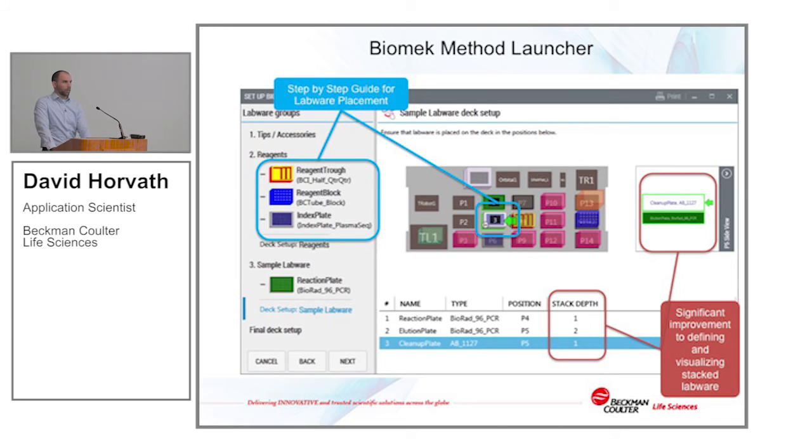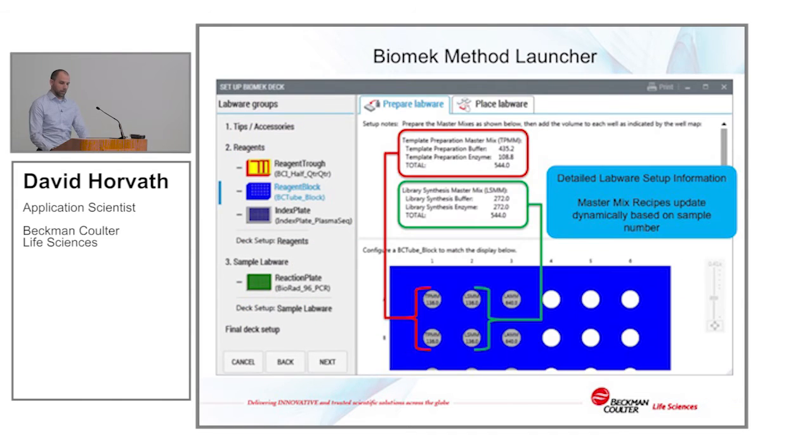After the user gets through the guided labware setup and places their labware on the deck, actually, there's one more step here. This is part of the guided labware setup. It's the step that you'll see if you click into a specific piece of labware that requires additional work. In the example, we have our reagent 2 block, and this is where we would traditionally see our reagent calculator with how to prepare your master mix or what wells to fill. That is now wrapped all up into guided labware setup.